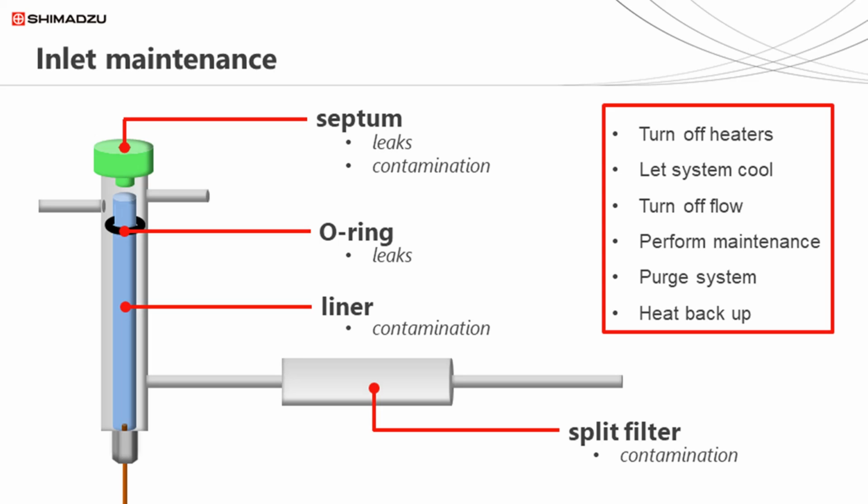In total, the instrument is usually out of action for 1 hour, and most of this time is simply waiting for the system to cool down or heat up. The actual time to perform the maintenance is around 10 minutes, or less for an experienced analyst.